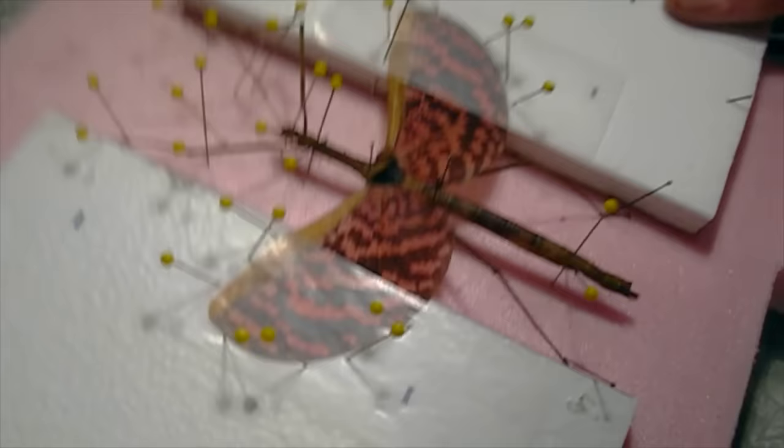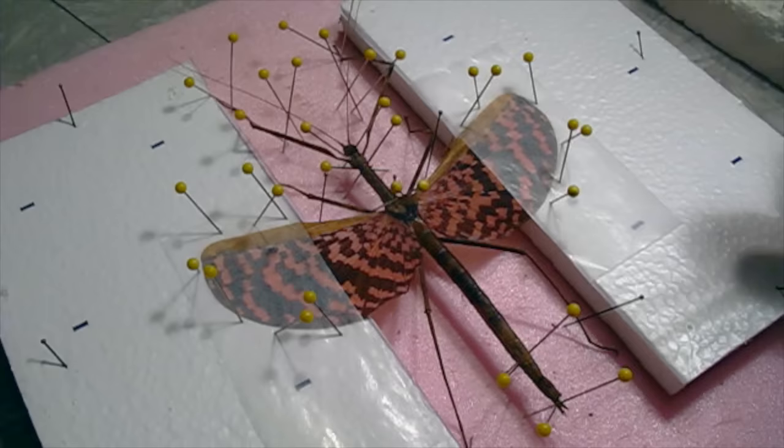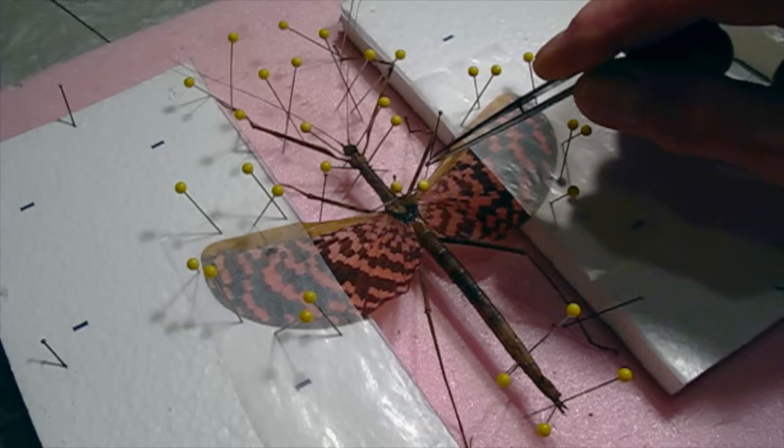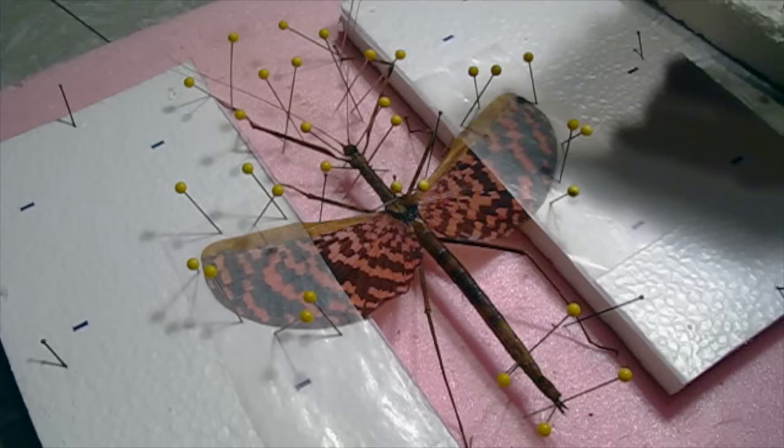We'll let that dry out — it'll probably take a couple of days. There's not much to them so it'll dry out pretty quickly. It's been about a week now and the specimen has dried. One adjustment I made is that I repositioned the middle legs — I had them going back underneath the wings, but I decided to put them up forward so you can see them. Both positions would be acceptable and natural for the specimen.